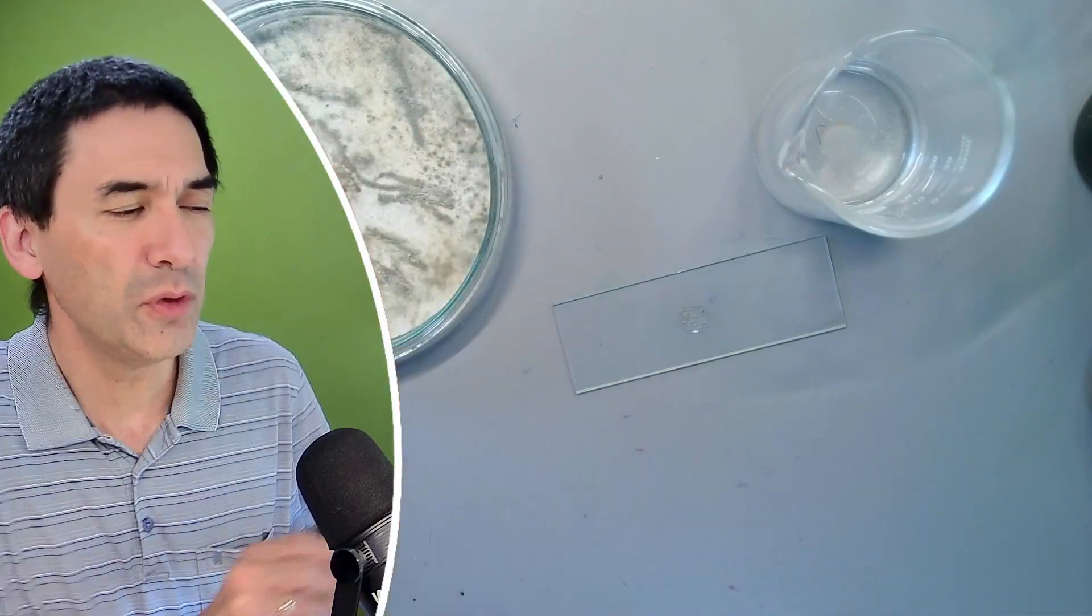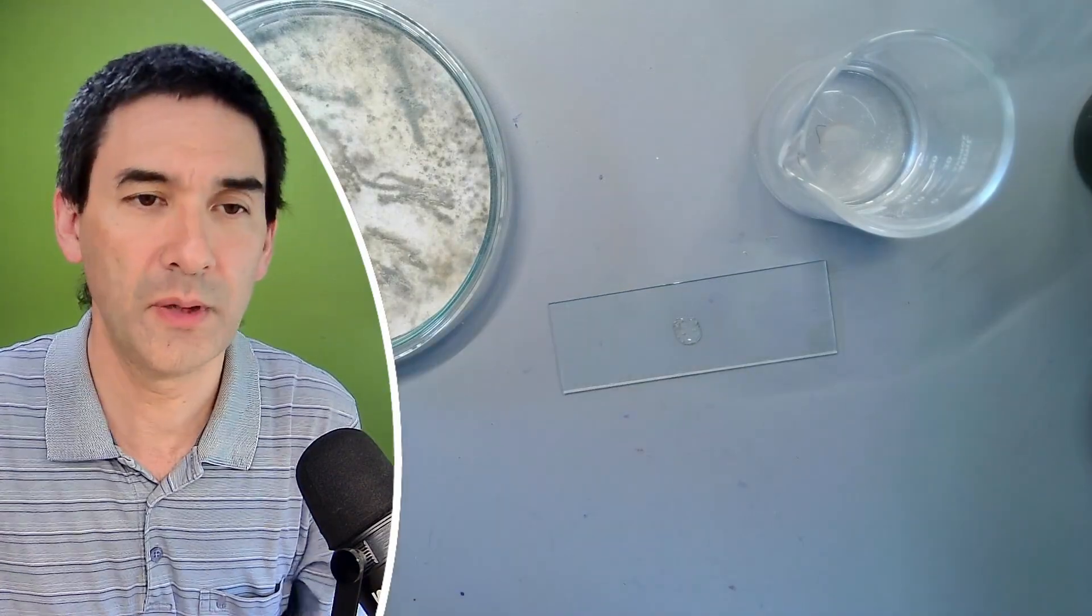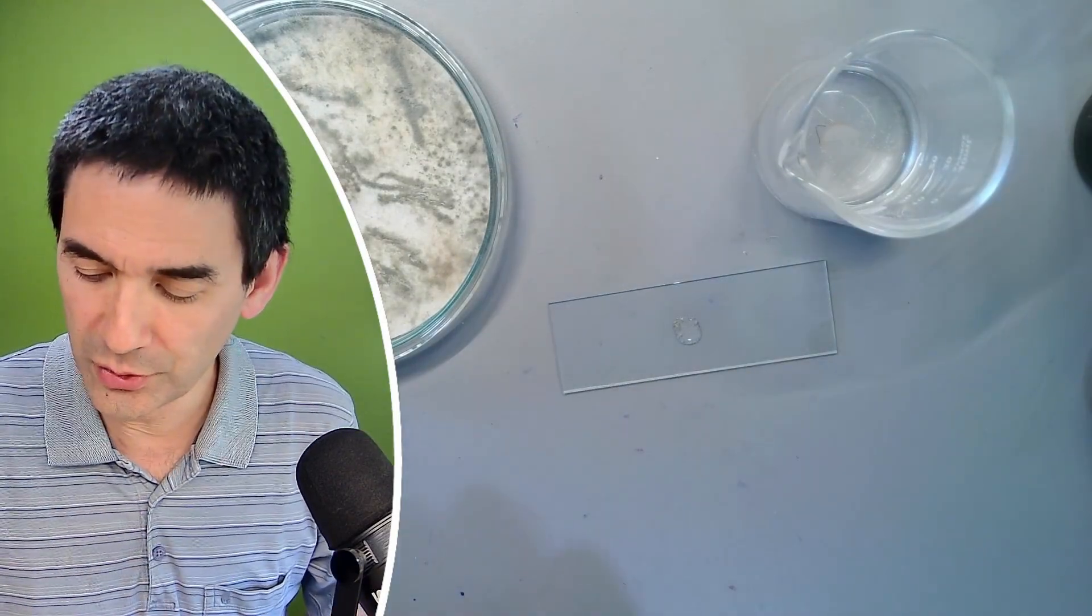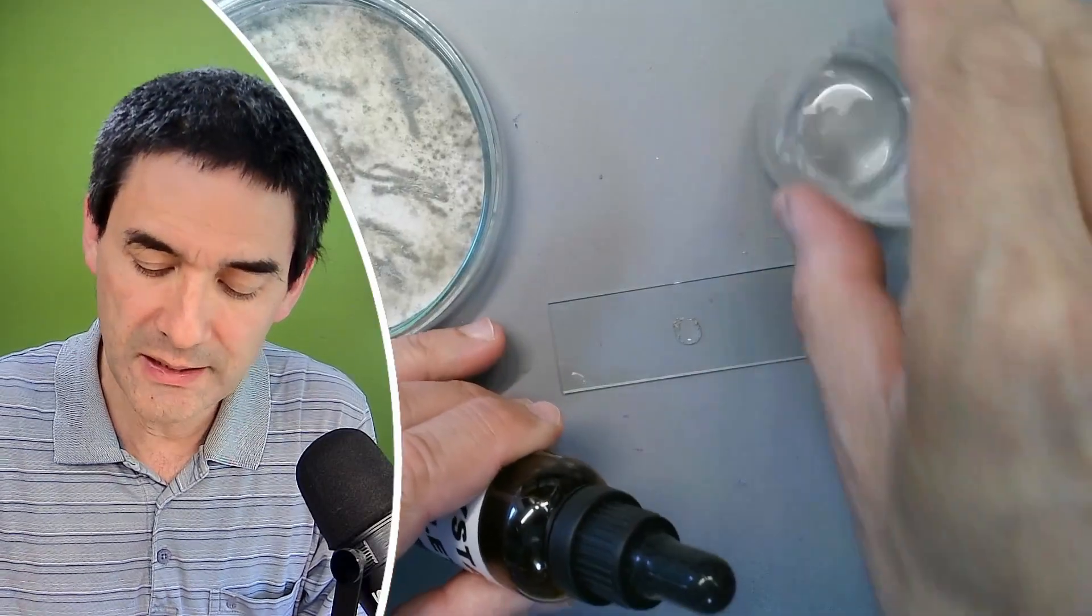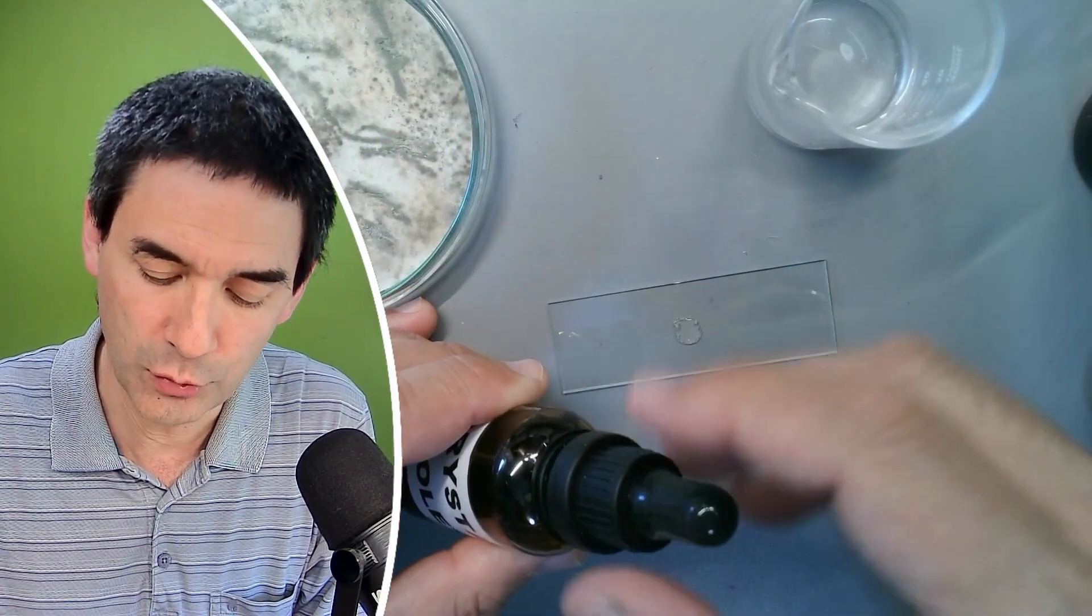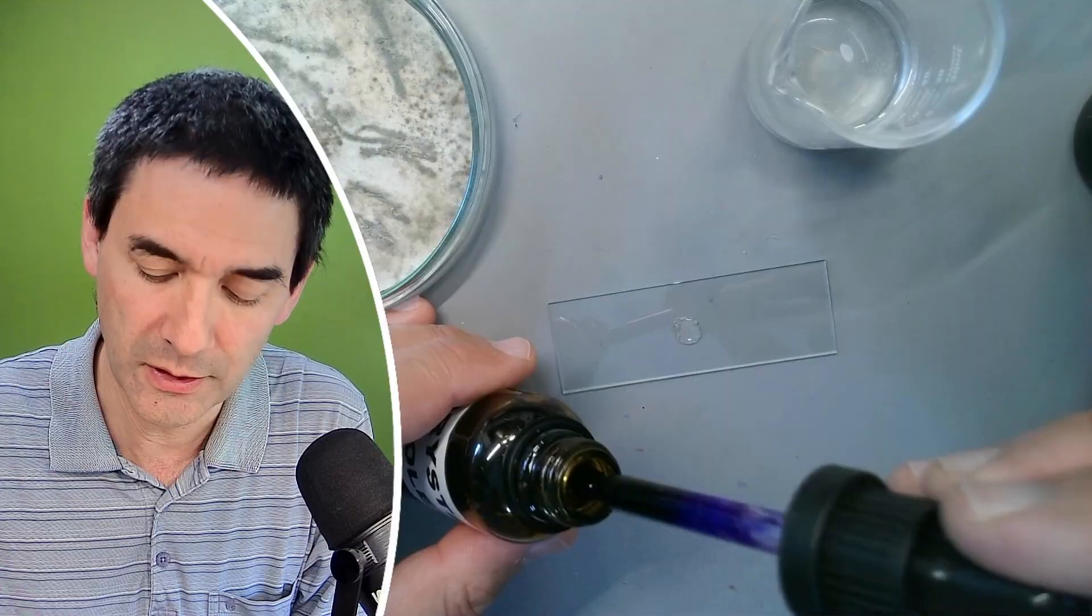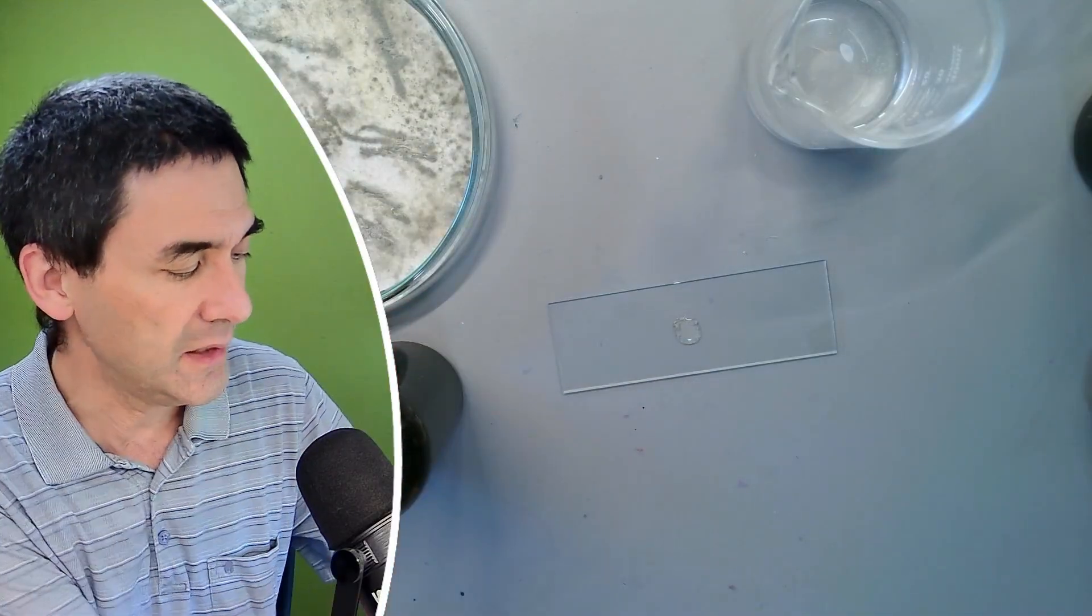And maybe I'm going to add a little bit more water as well. Otherwise it's going to be too little. So now to the crystal violet. Maybe just applying a drop here might be a little bit too much. So I'll use a pipette again, to take a very small amount.